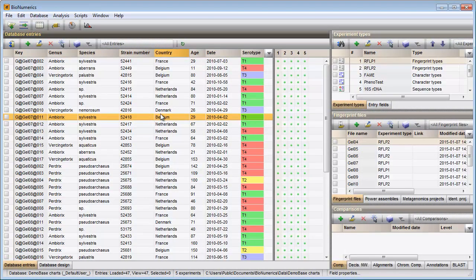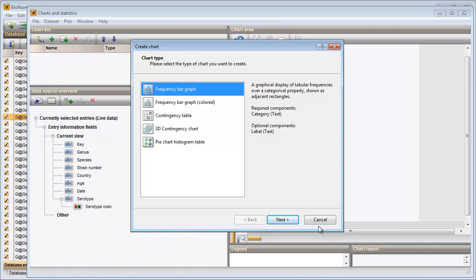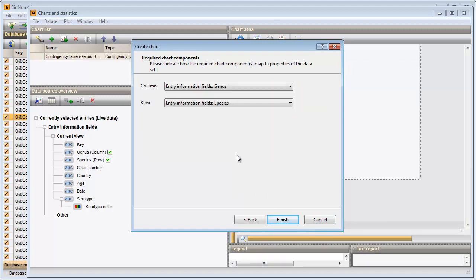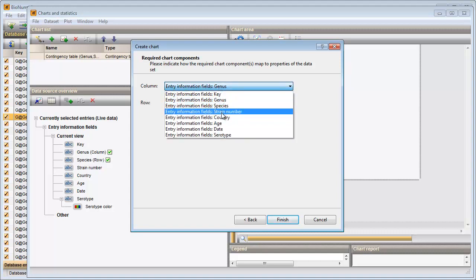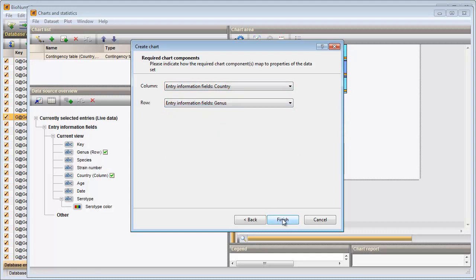In this example I will compare a set of entries based on two groupings. I make sure all entries are selected in my database using the Ctrl-A shortcut on my keyboard. I press this button to call the Chart wizard. I choose the contingency table option and choose my two groupings in the next step: country and genus. I press Finish to plot the data in the Charts window.